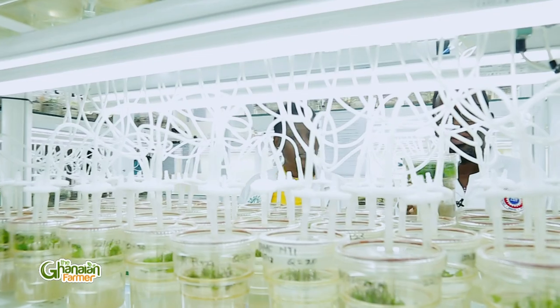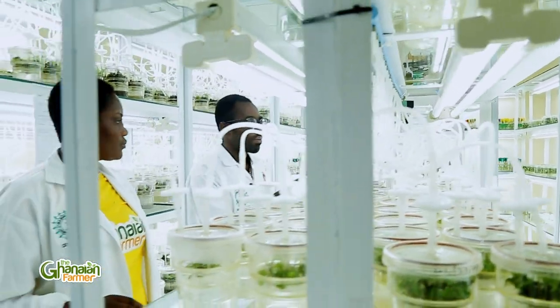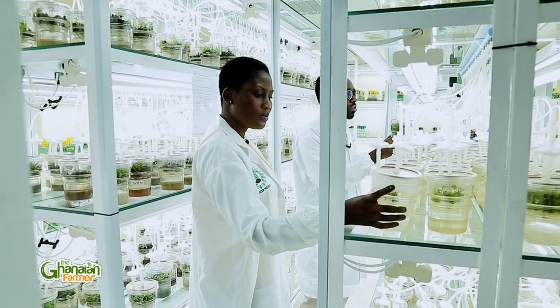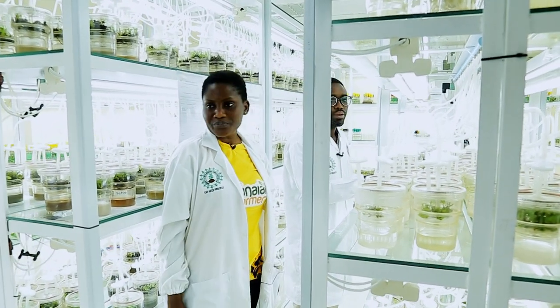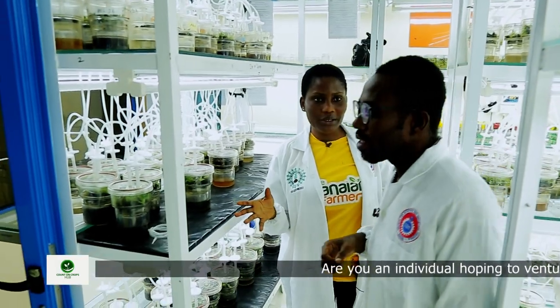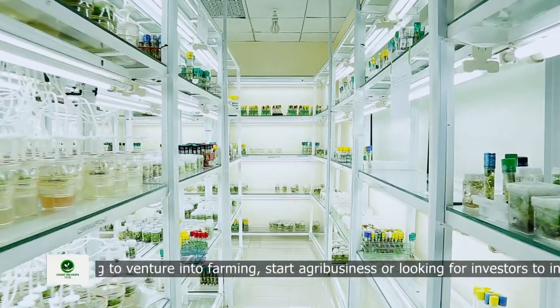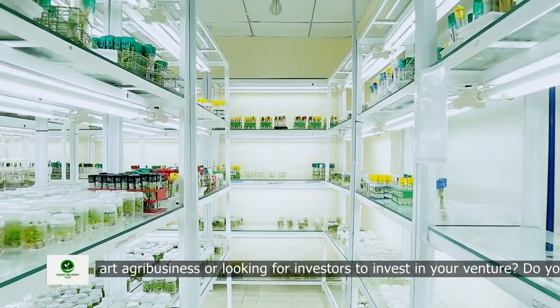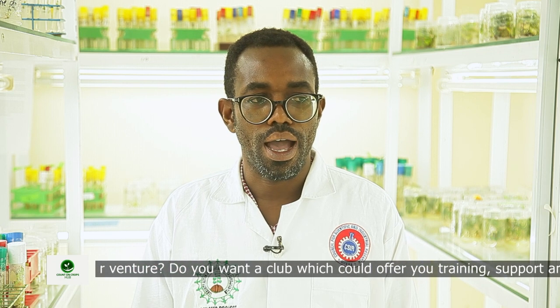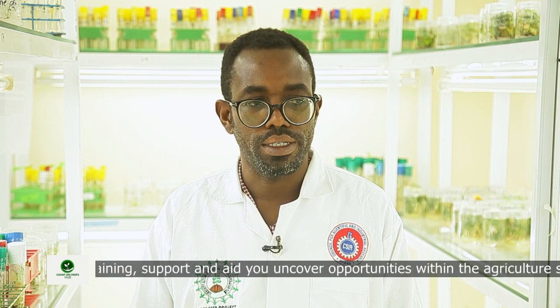In this space, I see thousands of glass bottles covered with rubber and tissue in them. How many varieties are you culturing here? The tissue culture laboratory at Crops Research mainly works on root and tuber crops — sweet potato, yam, banana, cassava, and plantain. Before we see the food we enjoy — our fufu and all that — it starts from here. If the planting materials are affected with diseases, we bring them here, remove the diseases, and then give them to the farmers to grow.